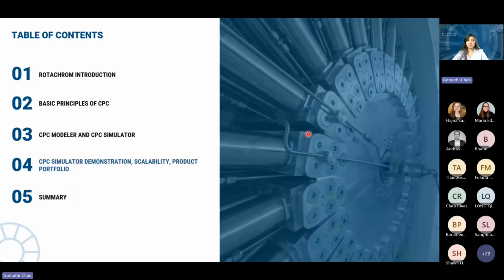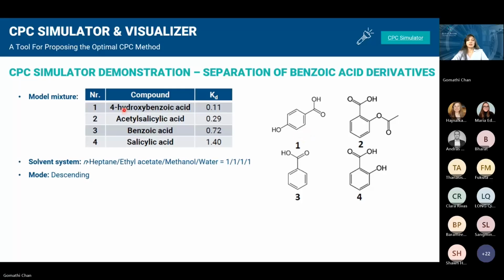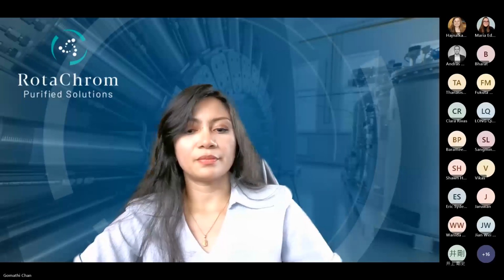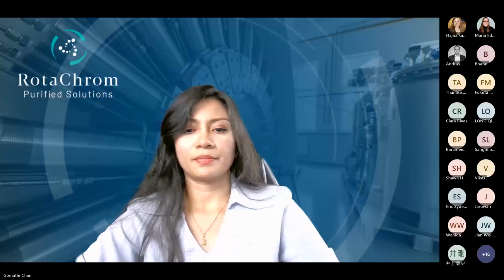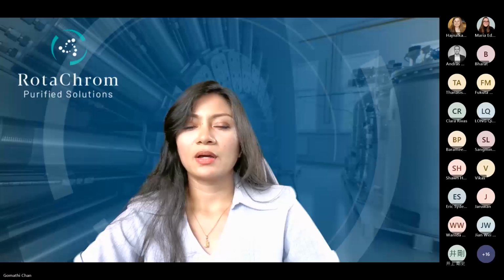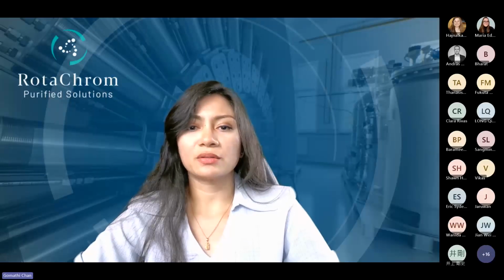So we will go into the demonstration now. I will be demonstrating the CPC simulation tool by using these 4 compounds and these 4 KD values. At this point, this is my reference solvent system. I will stop sharing first. Now I will share my screen.